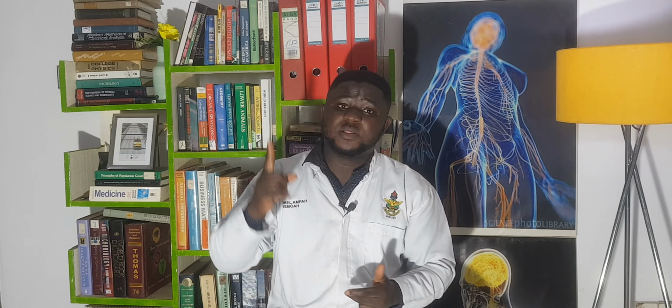And so now the objective lens can be made of normal glass. The eyepiece lens is also made of normal glass. So in a UV fluorescent light microscope, it's only the condenser lens that is made of quartz, and any other lens is going to be, ladies and gentlemen, made of normal glass.